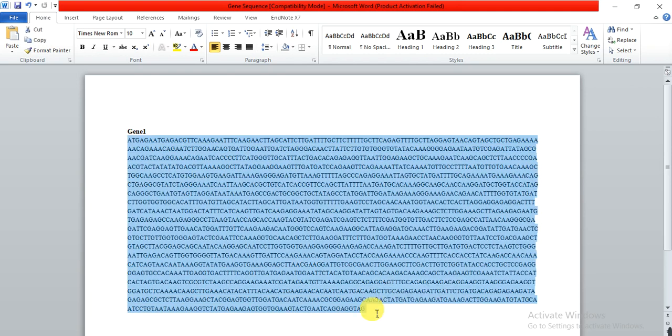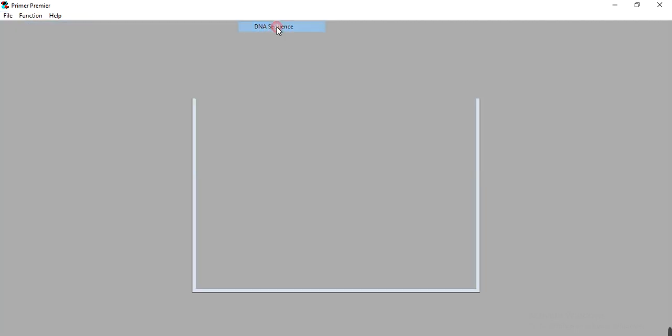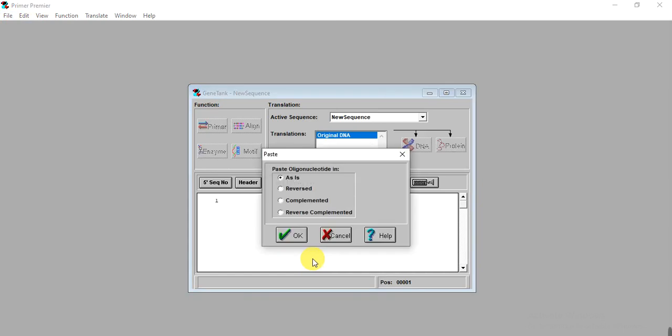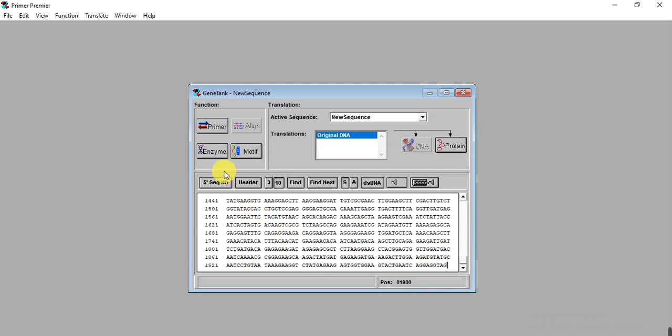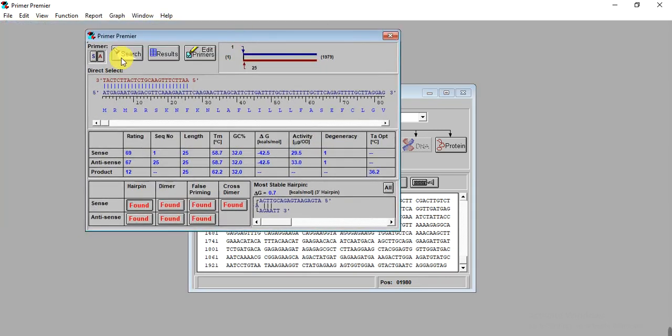You need to copy that sequence, then open Primer Premier software. Go to File, New, then DNA sequence. Paste it with Ctrl+V. It asks you how you want to paste it: as is, complemented, or reverse complemented. We need as is. Then select what type of analysis you want to do. We need to design primers, so we select Primer.